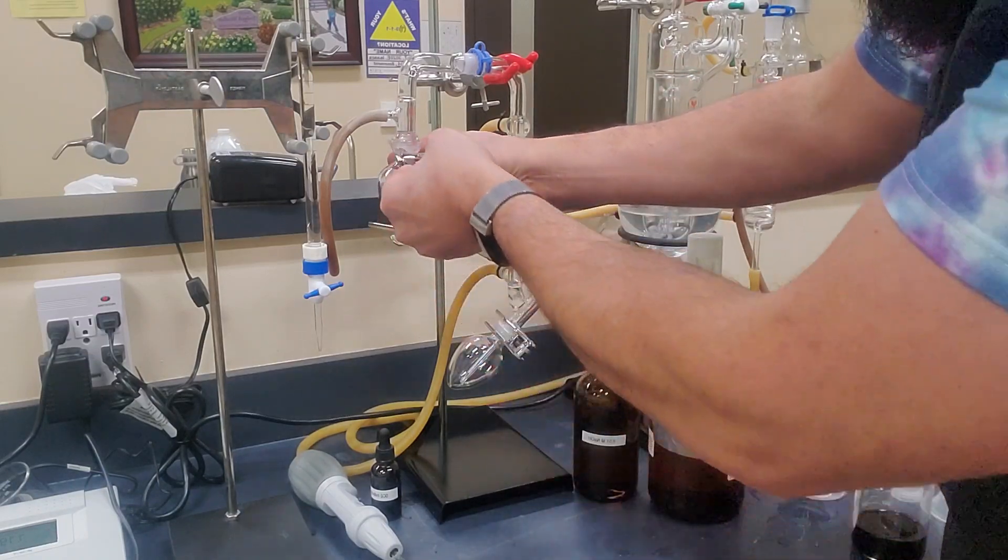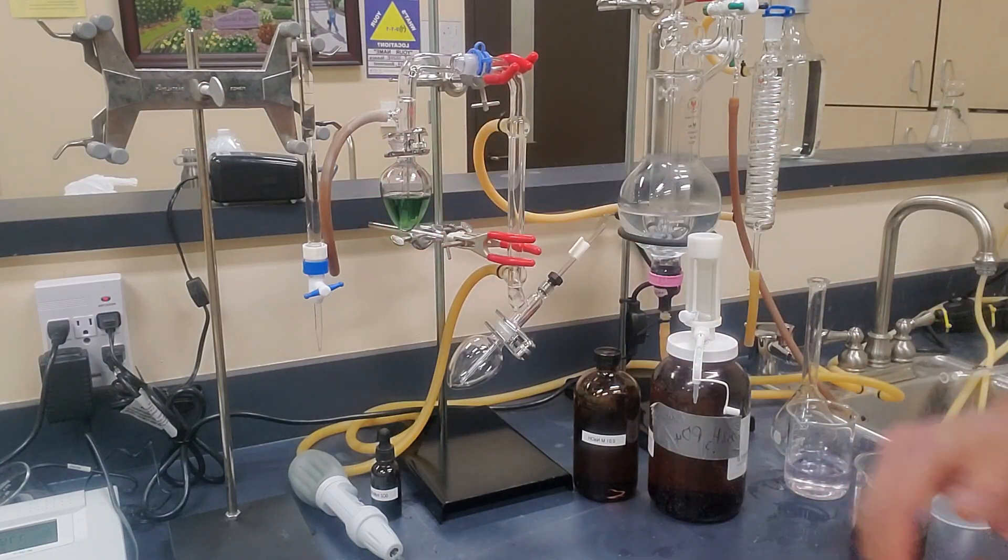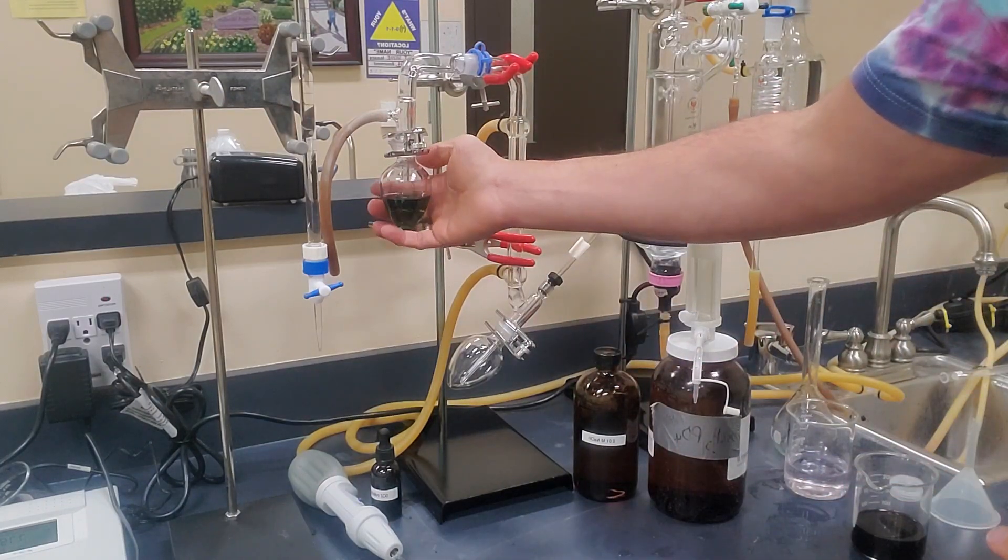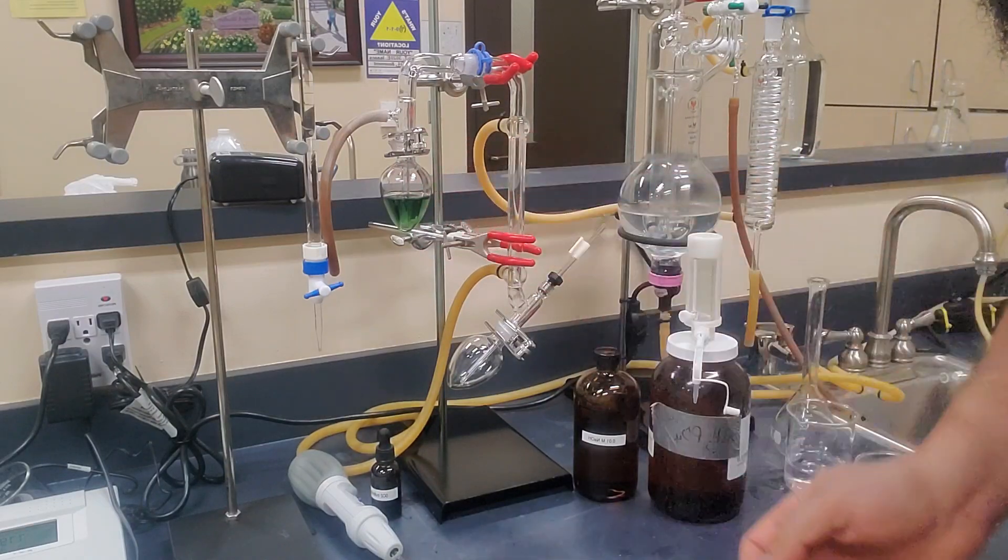And as soon as we get that all set up, we'll go ahead and put it on our machine here, our still. So that's step one is setting up the first flask. So hydrogen peroxide and a little SO2 indicator.